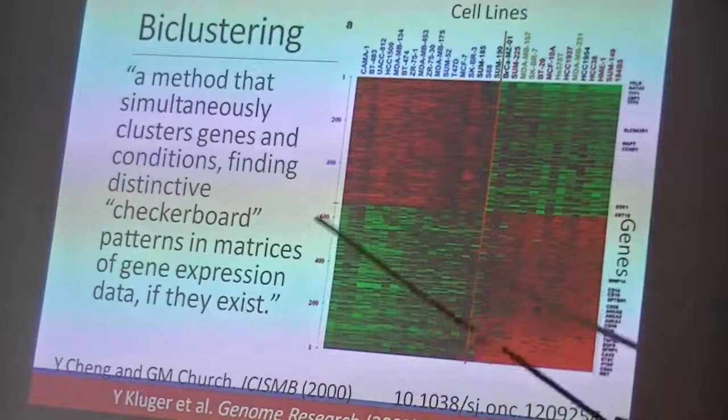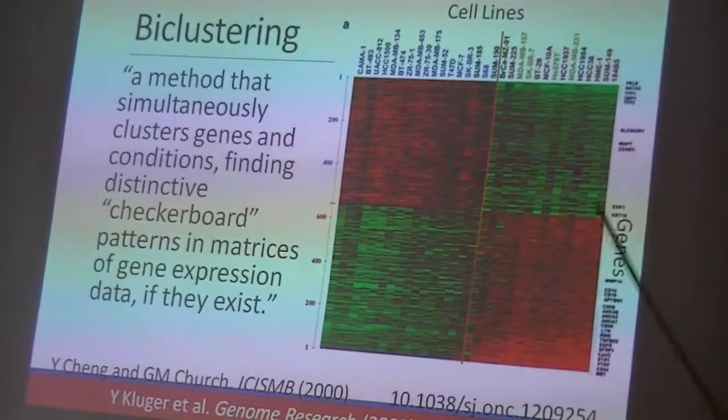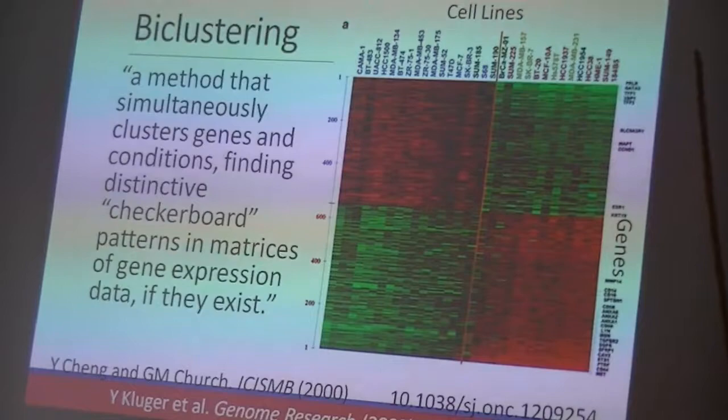we are able to ask which genes are related in the patterns of expression that they see. So here we see a pile of genes. Oh, I always forget which one is up. Is it red or is it green? Okay, I'm sorry. We'll just call red up for now. I'm sorry, I should know this.